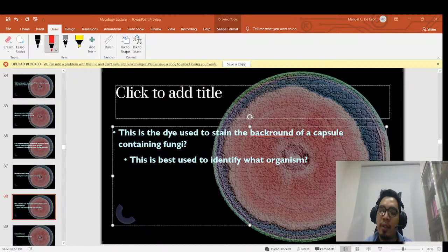Congo red or Nigrosine? Adrian, what is wrong with you? Why are you presenting us with random answers? Yeah, Nigrosine is correct. But don't add Congo red. I don't know where you got Congo red. Adriana, what's your answer? Congo red or Nigrosine? All right, I want you to be sure next time.